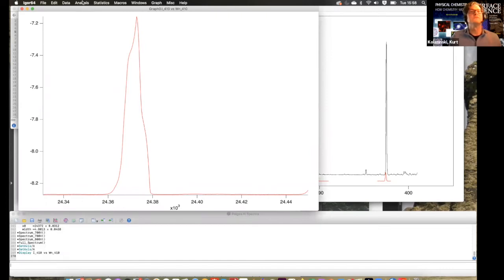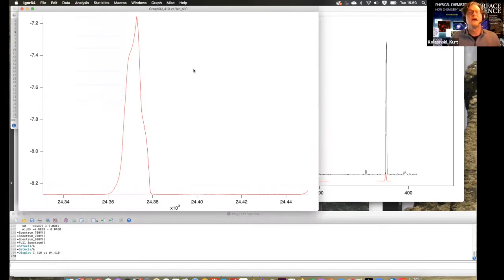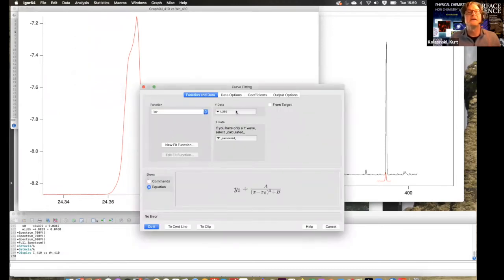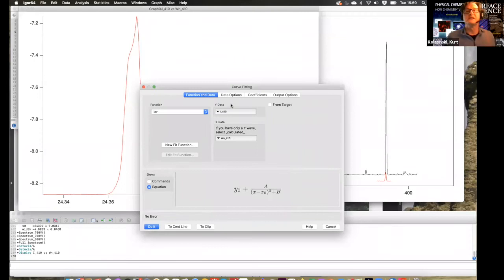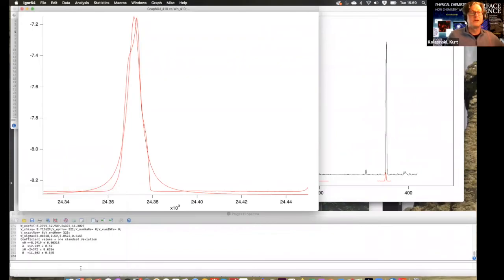And what I want to do is curve fitting, a Lorentzian. So let's pick a Lorentzian. And the data I have on here is I410, and we're doing that versus wave number 410. Make sure you have the right one in there. Right. Okay, and we can fit that. And there is the central portion of the wave number. It'll also write it down here.